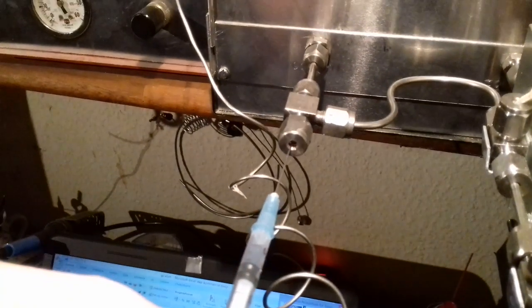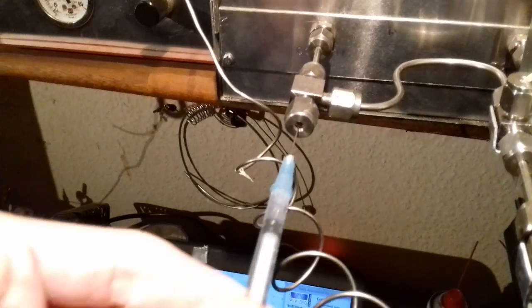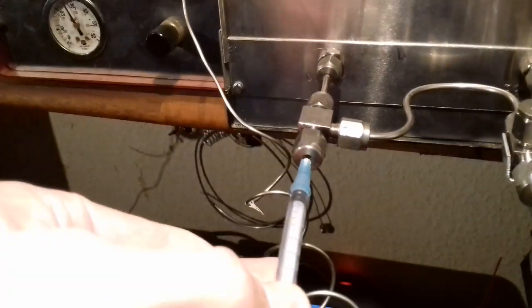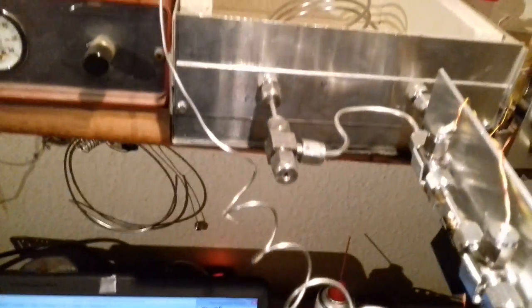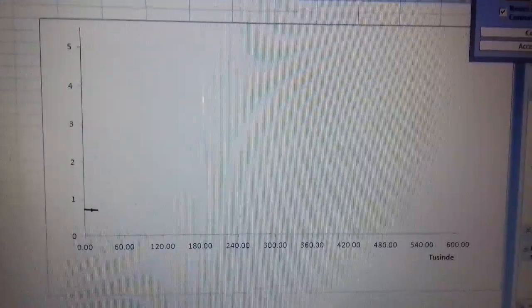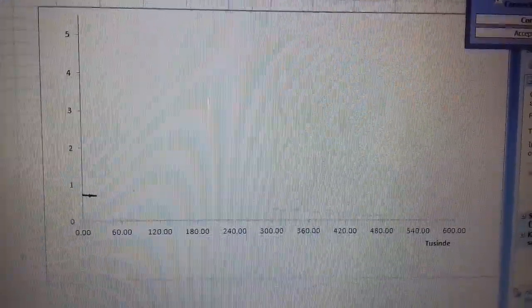This is my latest project - a home-built gas chromatograph. Let's see now. That's a sample injected into the instrument, and we should see some peaks.